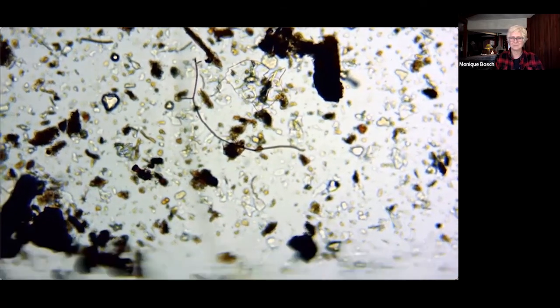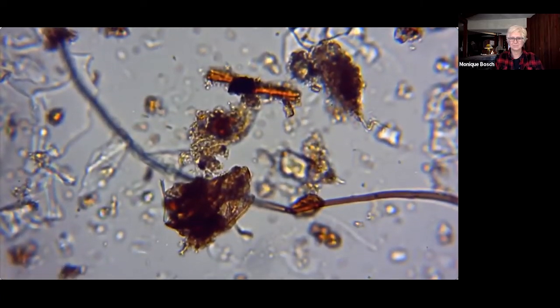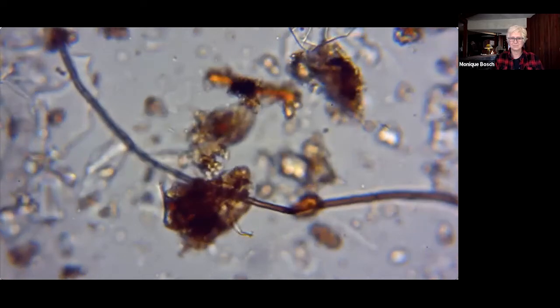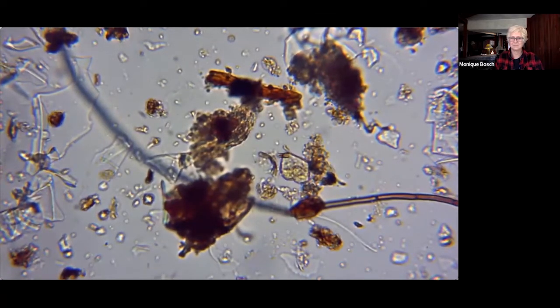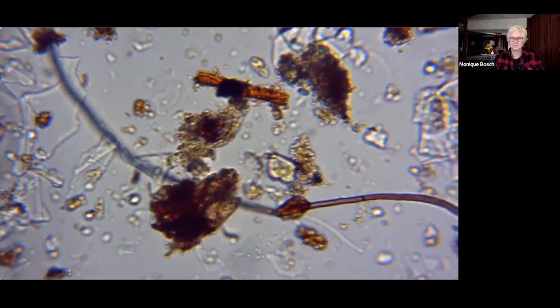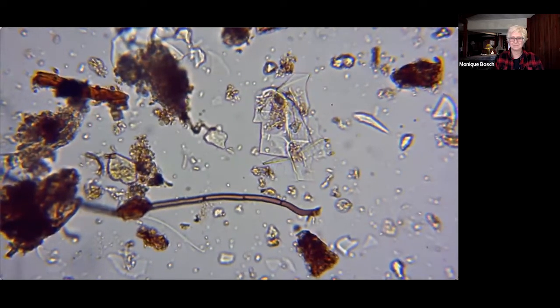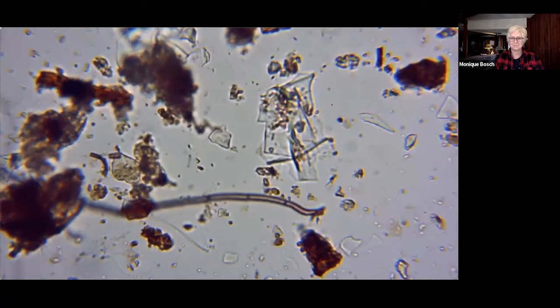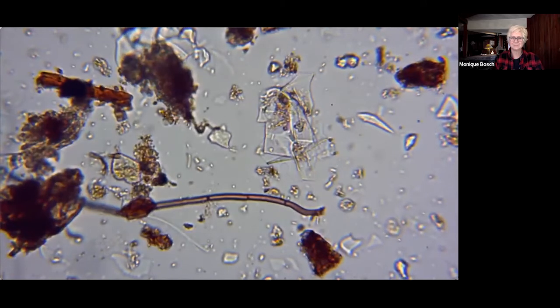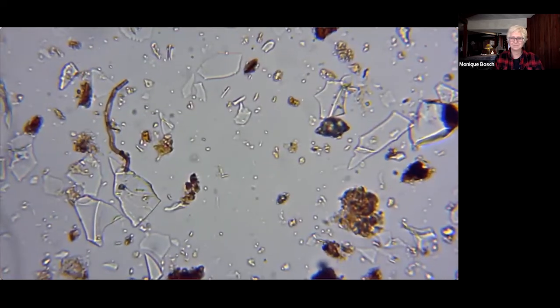That's 100. This is 400 times magnification. Nice aggregate structure there. Sandy, you can see those glass bits. That is sand. So there's nice septa along that fungal hyphae there, partitions between the cells. And in the background, you can see good diversity of bacteria. You have some rods and some cocci, round cocci.